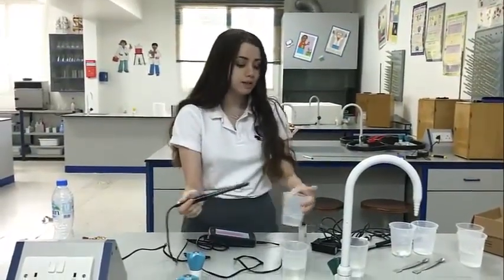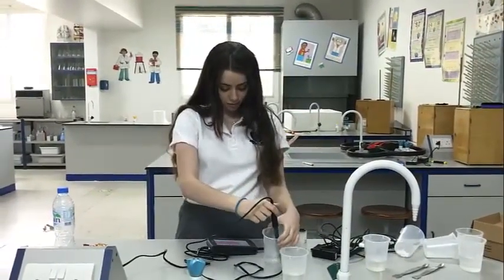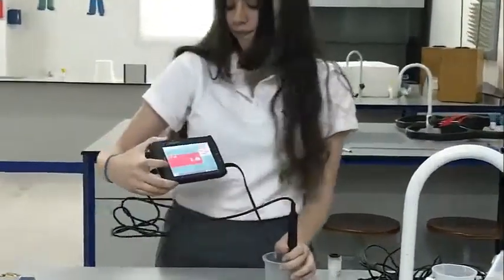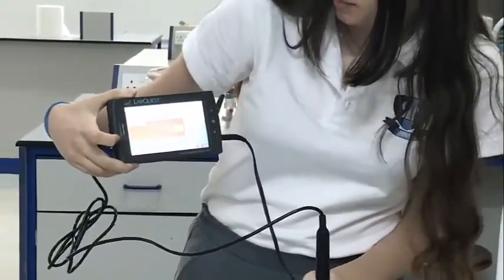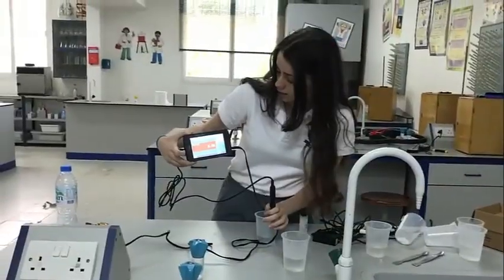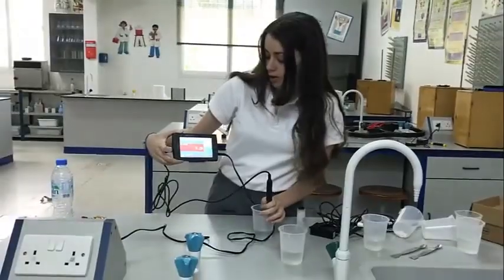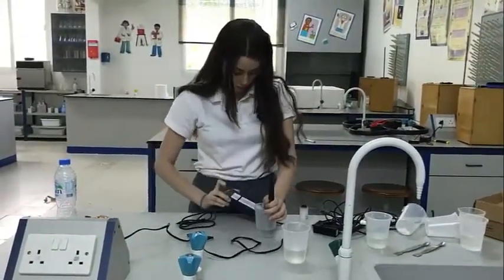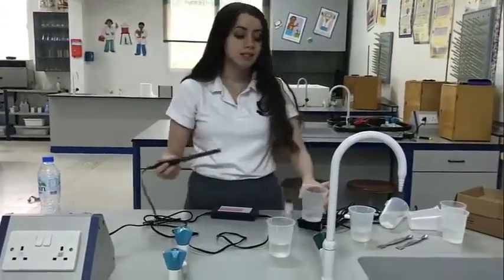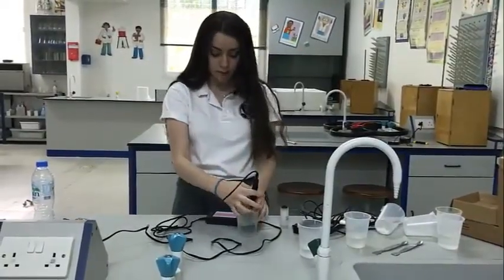Now we're going to try in an acidic substance. And it has to be less than 7 to prove it. Yes. And it's continuing to change. So it's approximately 3.29. And that proves that it's an acidic substance, because as we said, if it's less than 7, it's going to be acidic. Now this is a neutral substance, so it has to be approximately 7.